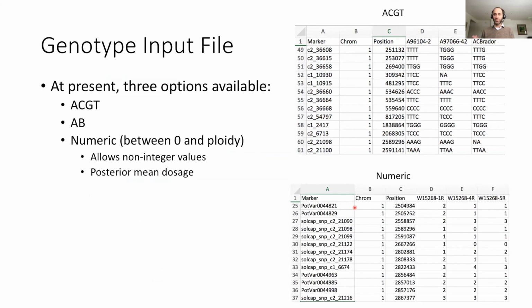So if you have centimorgans, you may need to just shuffle your decimal place over, like for example, reporting in millimorgans or something other than centimorgans, just so it's a whole number. But I know when people worked in barley, we didn't have a reference genome, and we were using consensus maps from a couple different mapping populations to do some GWAS. So it can work just fine like that too.